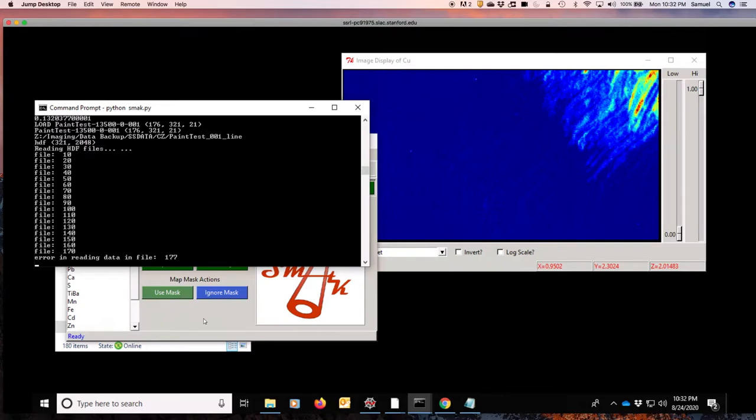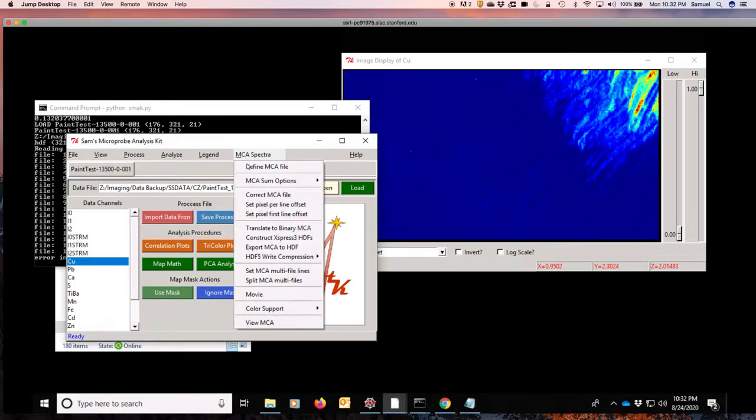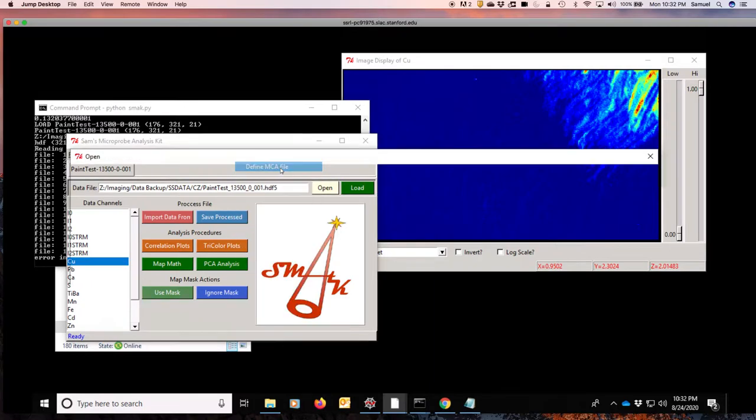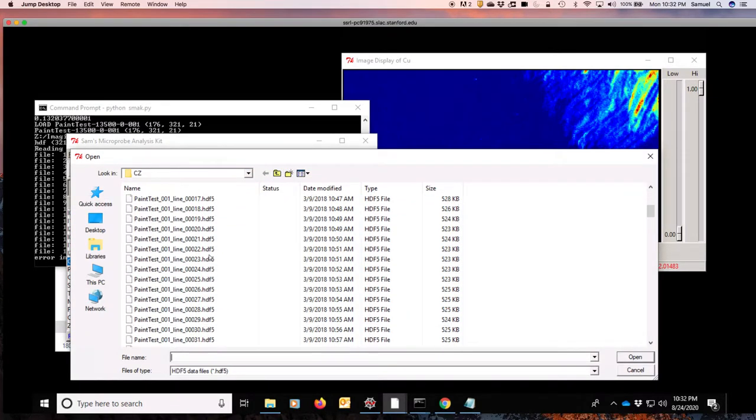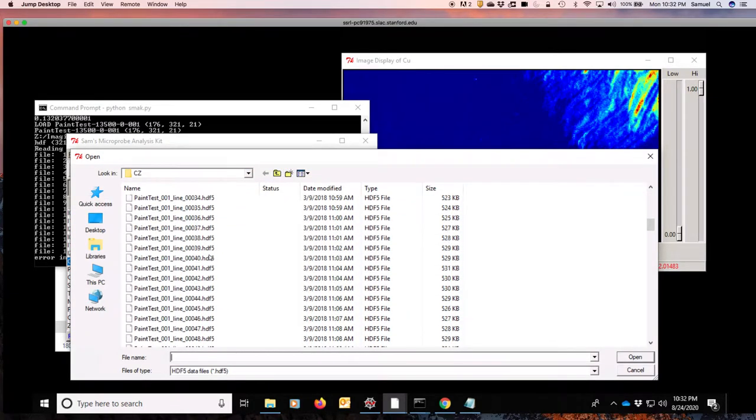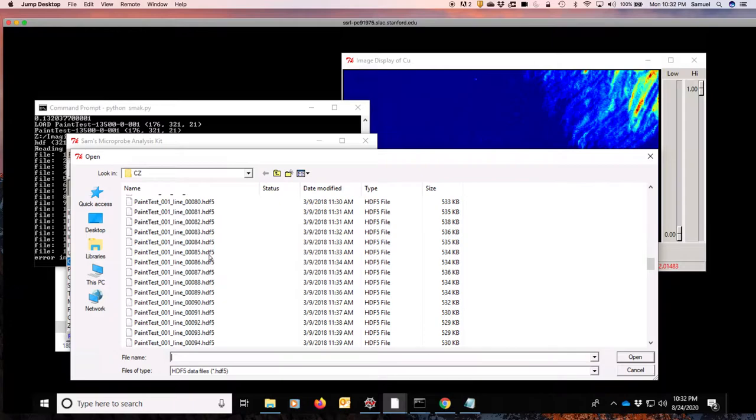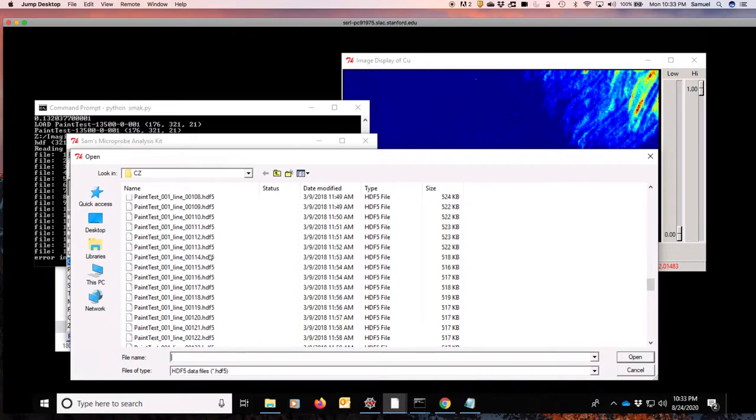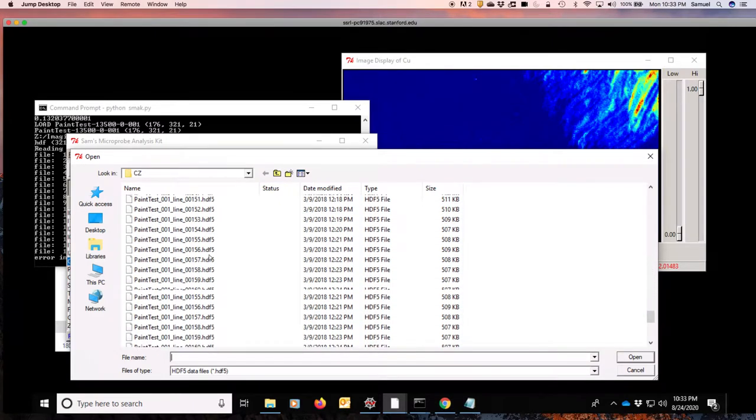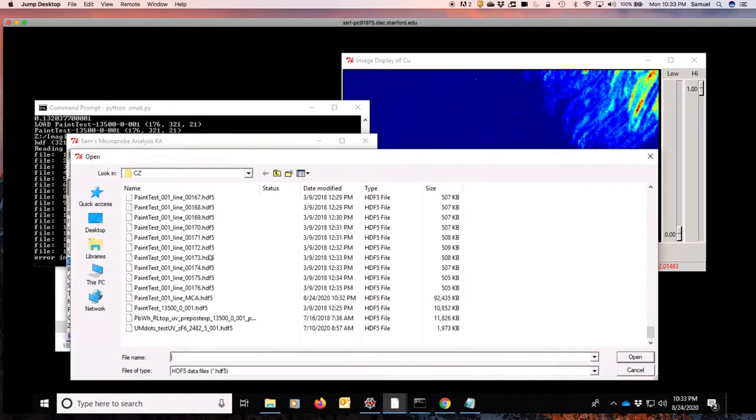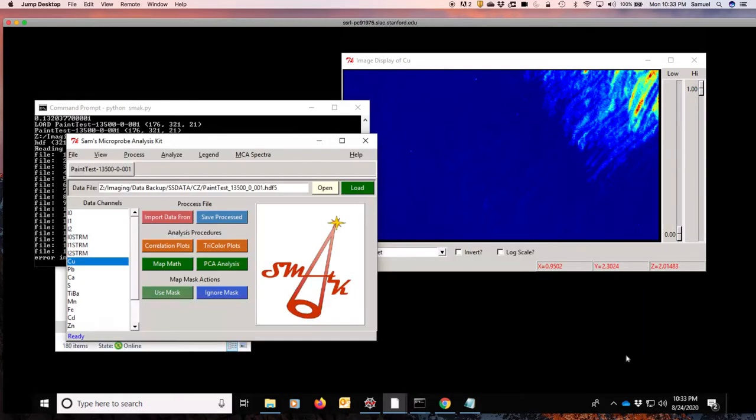Now we'll have created this new data file. And just like with the MCA spectra, we can define this file. We're going to define it as the MCA file, but it will really be our spectral data. And we'll scroll down and we'll find the new file that's been created by this process. And it is this MCA file right here. Open that up.